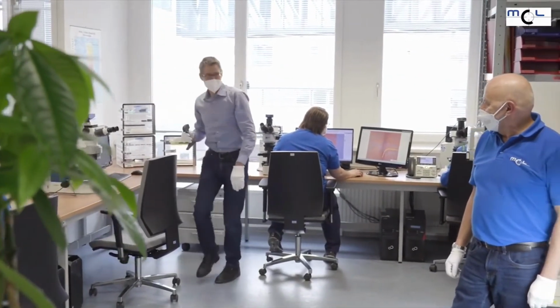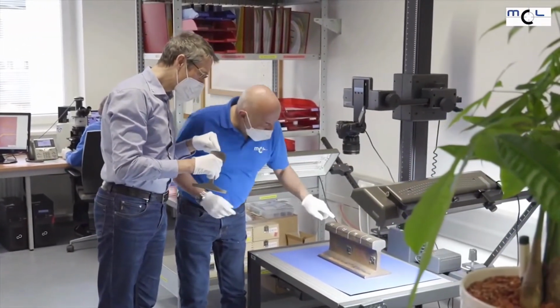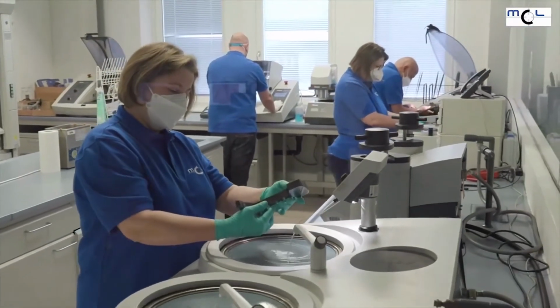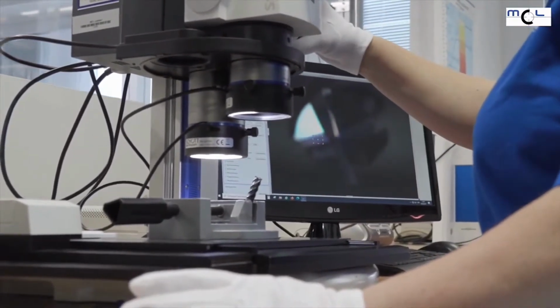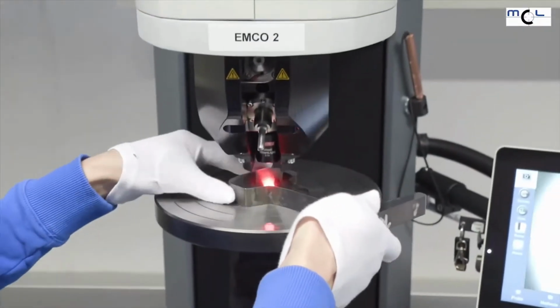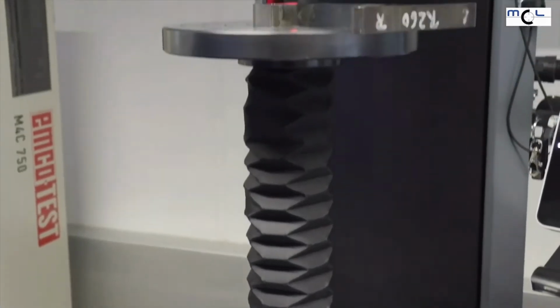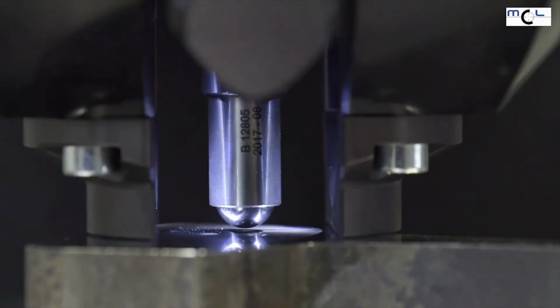The starting point for our lab tour is the metallographic lab. Comprehensive component or failure analysis start in this laboratory. Here we receive the components and samples, document them and prepare them for further analysis. Our staff works under the highest quality standards according to the requirements of the ISO 9001 and also ISO 17025 in the accredited area of the testing laboratory. Microstructure characterization as well as hardness tests give us the first opportunity to deduce a property. However, not only microsections are produced here. The material is prepared for all further high-resolution testing methods.